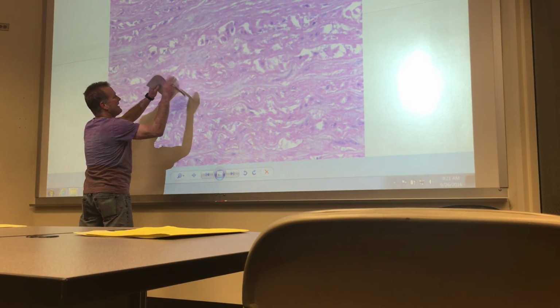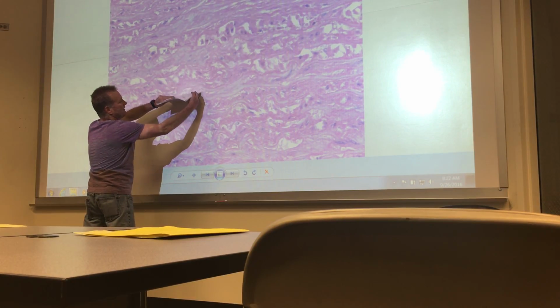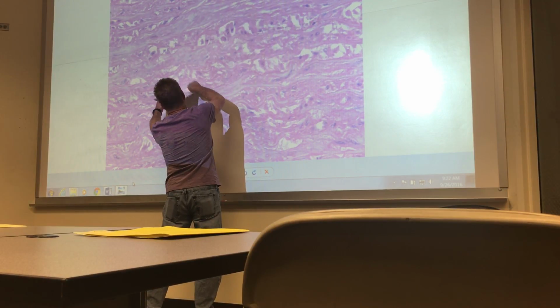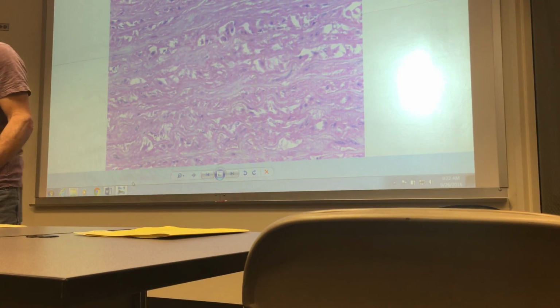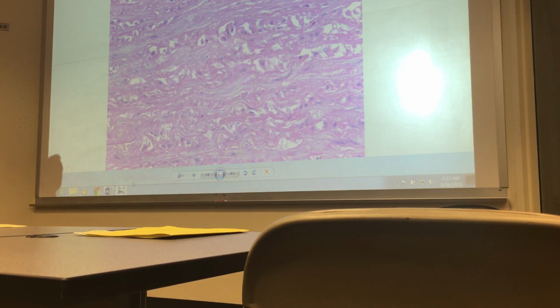You're looking at this edge. And if they're tilted a little bit, you get an impression of thickness because you're seeing part of the top or part of the bottom. So the wall of the arteries is perforated with these sheets of elastic connective tissue. I think this looks like Swiss cheese.